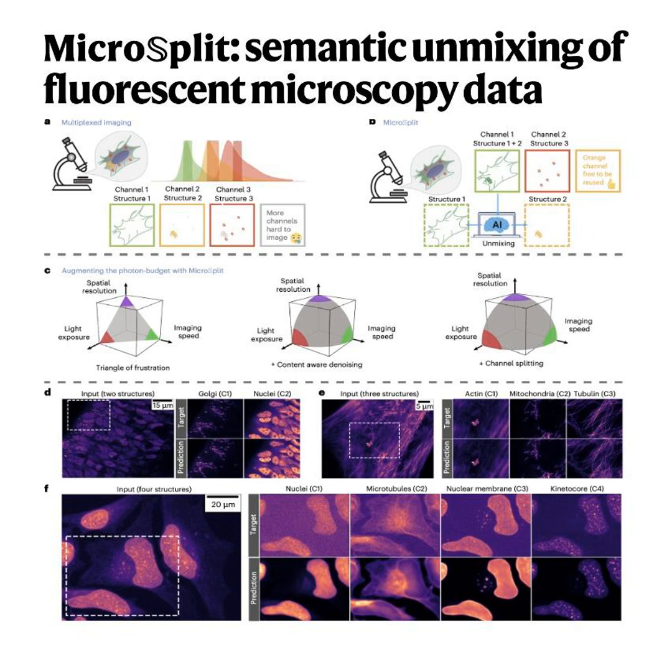Everything is overlapping. Right. But MicroSplit is like an AI that takes that single muddy audio file and flawlessly isolates the drums, the bass, the guitar, and the vocals into 4 completely distinct, crisp audio channels. That translates perfectly to the imaging application, actually, except it's doing it with overlapping cellular structures. So how does that look under the microscope?